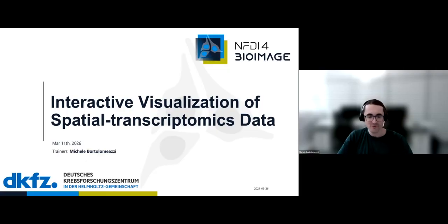Today I would like to go with you through some theory and then some examples of ways we can visualize, and especially explore interactively, our spatial transcriptomics data, since this goes beyond images and sequencing.